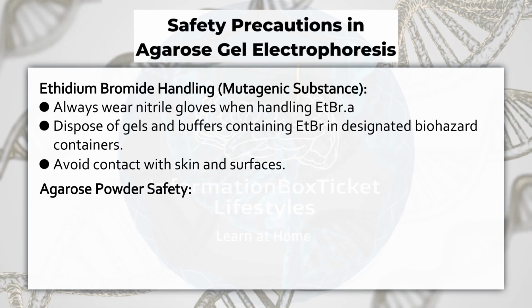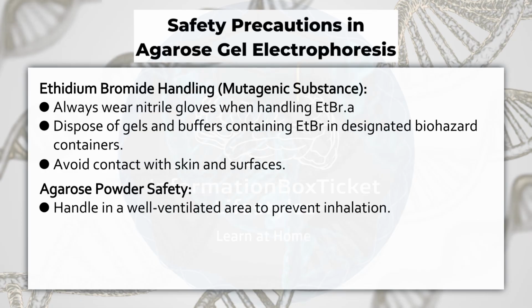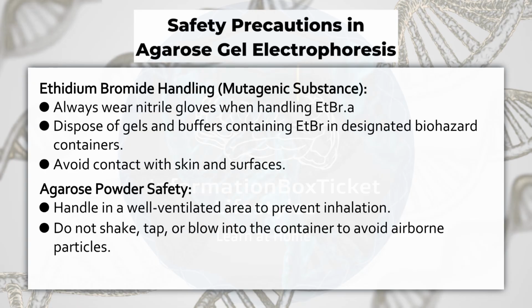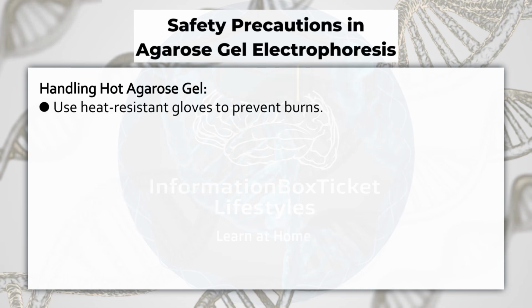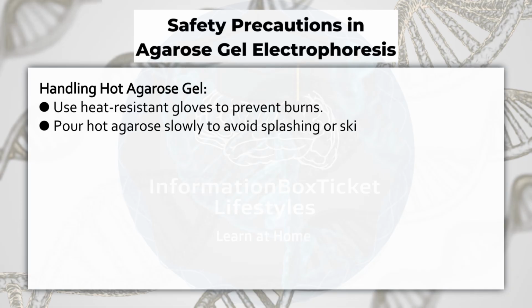Agarose powder safety. Handle in a well-ventilated area to prevent inhalation. Do not shake, tap, or blow into the container to avoid airborne particles. Handling hot agarose gel: use heat-resistant gloves to prevent burns. Pour hot agarose slowly to avoid splashing or skin contact.